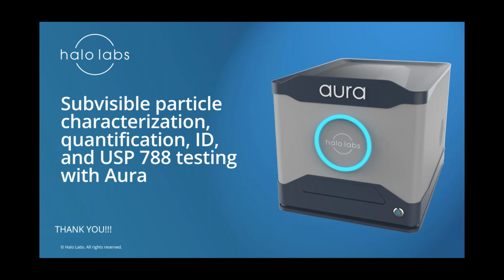There was a question about AAV. To be a little more specific, the question is, are AAV particles measured with the Aura, and do they stain with thioflavin T? Yes, we can measure them with the Aura.